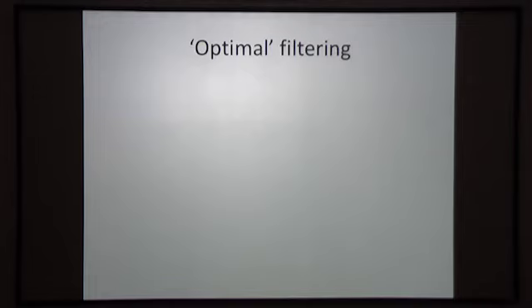And by estimating the amount of noise that there is from the images themselves, and that's part of these maximum likelihood algorithms, we can then do something clever, which Paula mentioned. You can use these low-pass and high-pass Fourier filters to denoise your images and then get the best possible alignment. If you remember, she had images of Max Perutz, and then she could take away all the hairs and focus only on the low spatial frequency components.